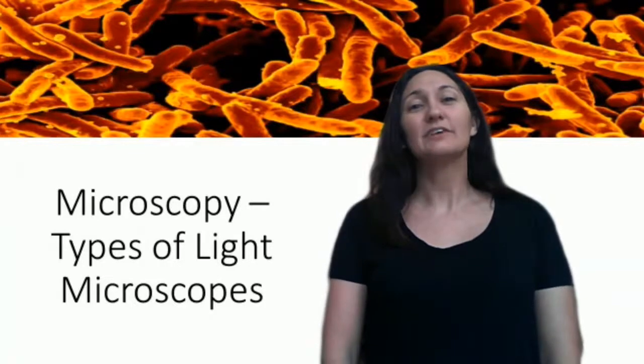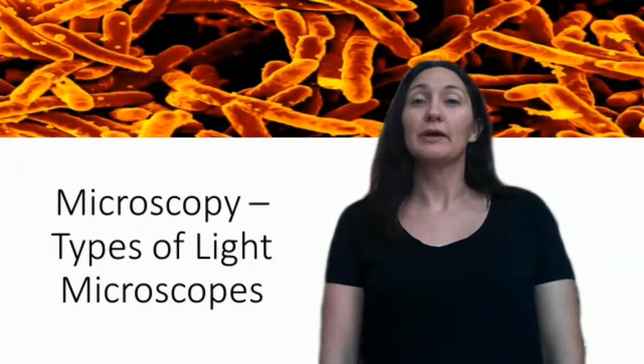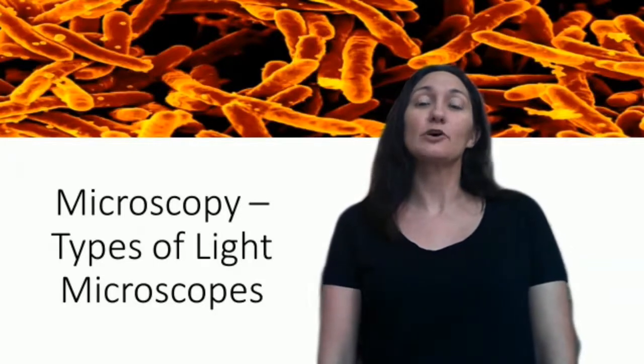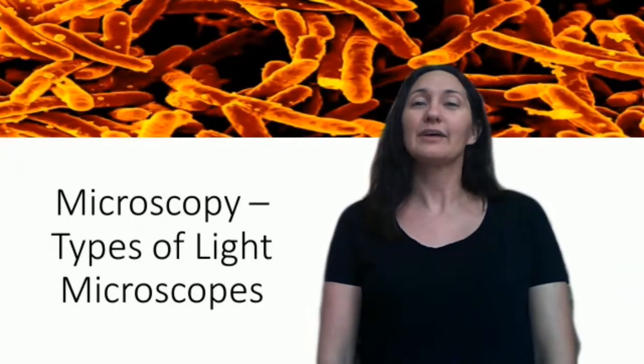This is the last video in the microscopy unit. Previously, we talked about the differences between a light microscope and an electron microscope. However, there are lots of different types of light microscopes. So in this video, we're going to look at some of the main types of light microscopes, talk about how they differ, and why you might choose to use one type of microscopy over another type. Okay, let's get started.